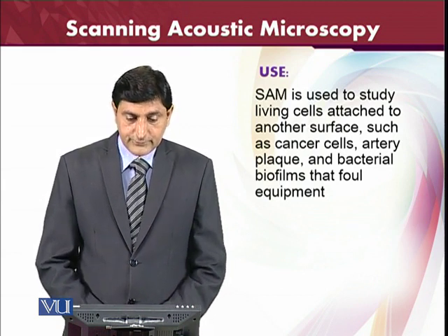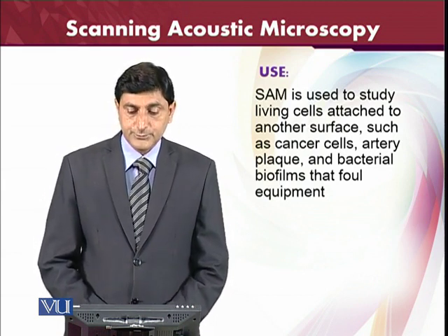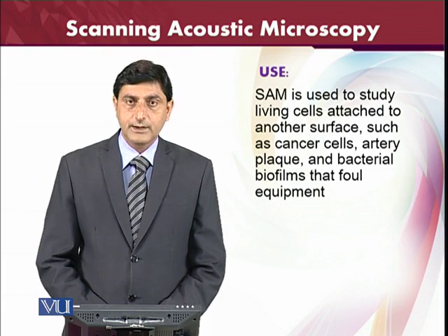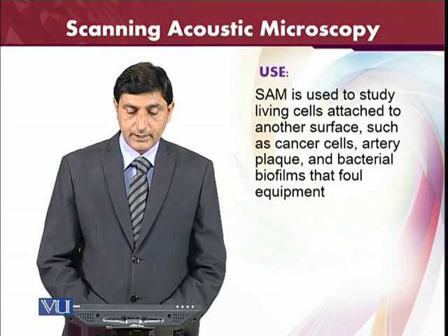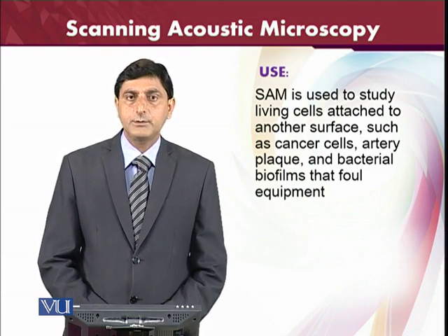The applications of scanning acoustic microscopy include studying living cells attached to another surface, such as cancer cells, artery plaque, and bacterial biofilms that foul the equipment.